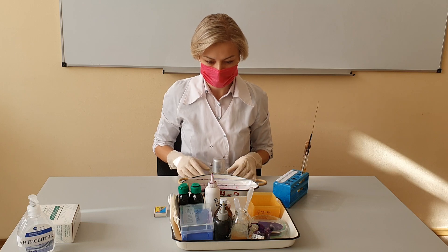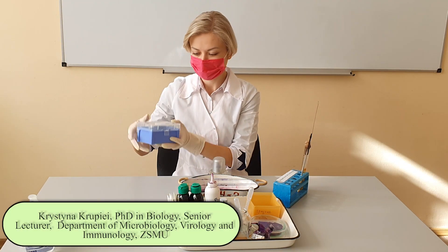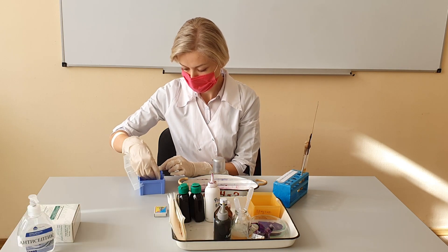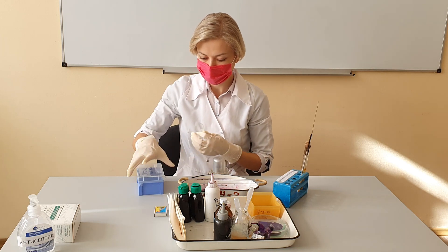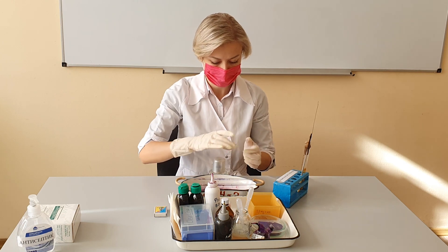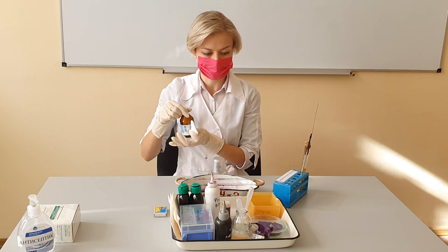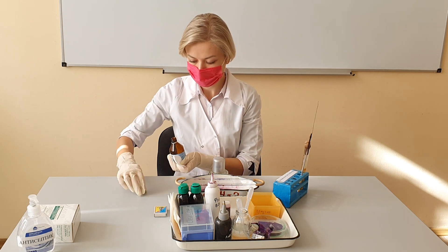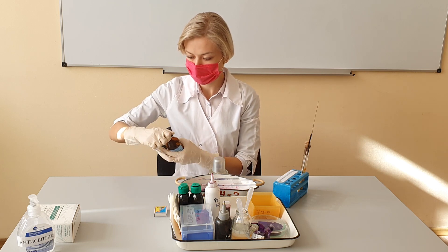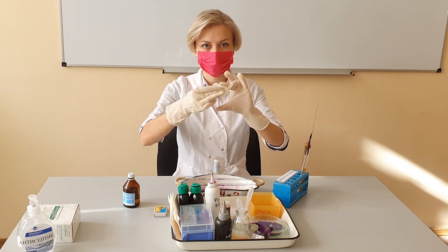First, we need to take a clean glass slide and degrease it with 96% alcohol. The first step in most bacterial staining procedures is the preparation of a smear. A good smear preparation is the key to a good stain — the most common errors in staining are due to poor smear preparation. We put alcohol on a cotton sponge or gauze and thoroughly wipe the glass on both sides.